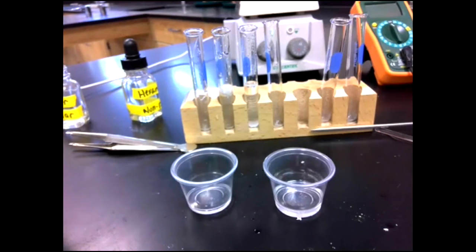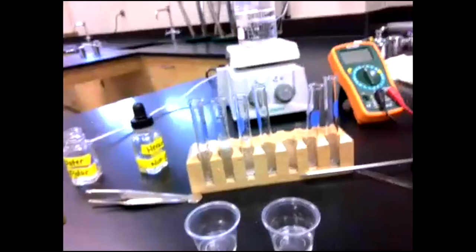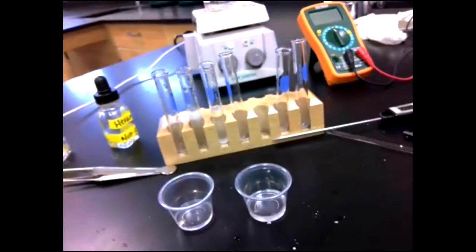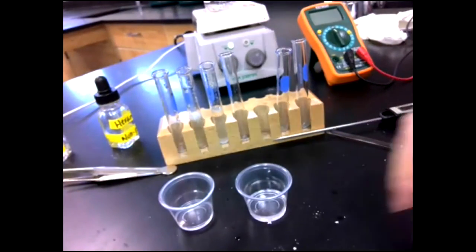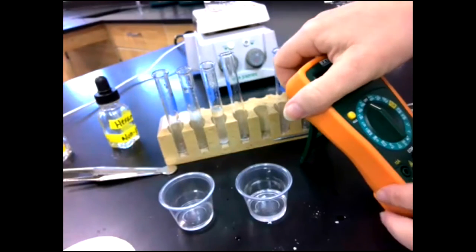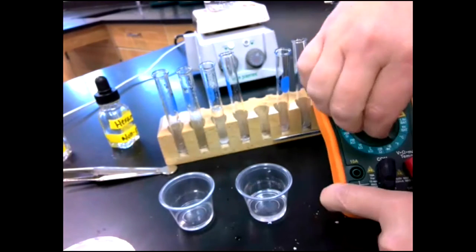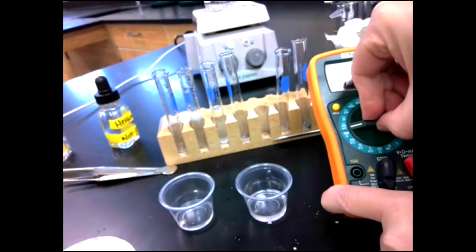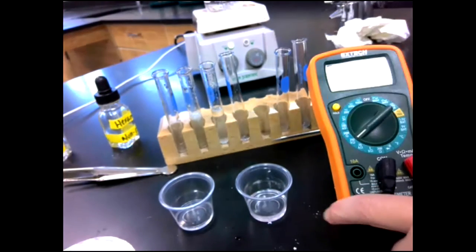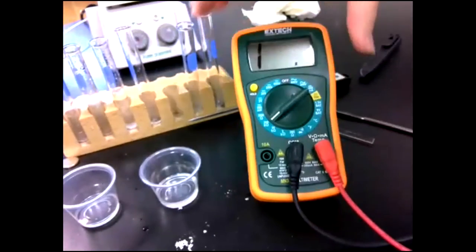And we're going to look at conductivity using the same meter. I was going to do this at home, but I brought everything home except I had forgotten the conductivity meter. So I'll fix it so you guys can see it. We're going to use the same conductivity meter that we used for when we did metals and non-metals. So just to remind you what it's measuring, it measures resistance.